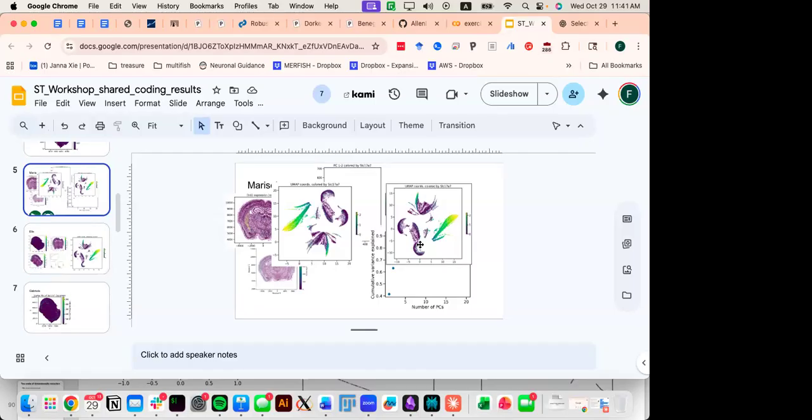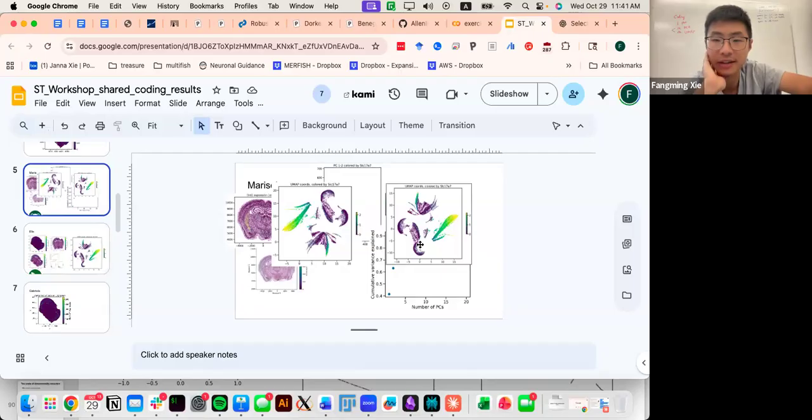Sorry, so is that why when you reran your own code it looked more V-shaped and more U-shaped? Yeah, that level of variation is intrinsically there in UMAP, so any time you run it, it'll be a different answer. There are ways for reproducibility, though. You could try to make it fixed every time you run it by specifying a fixed random initialization. That I think you can do.